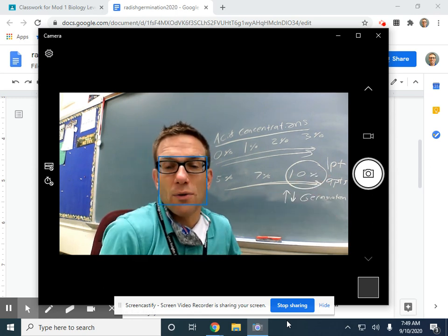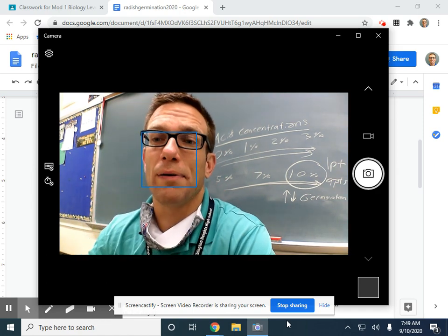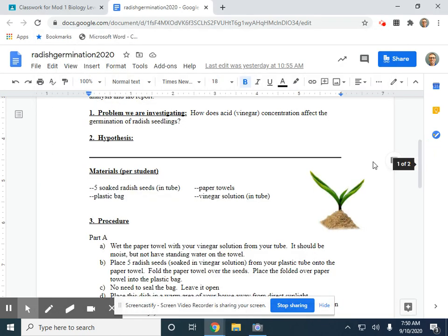Okay? So right now, pause the video if you need to. Write your hypothesis. You write it right on that sheet that I had given you when you came in. When you write your hypothesis, you do one statement, and once you've written it, go back and reread this problem. Does your hypothesis answer that problem? I will never mark your hypothesis wrong. It doesn't matter if you're wrong. You don't know the answer to this question. That's why you're doing the experiment. Okay, so take a minute, write out your hypothesis.